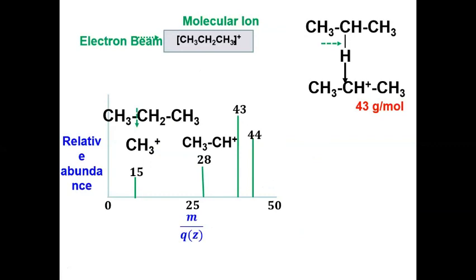Then we will get the peak at 43 gram per mole, a fragmented peak in the mass spectrometry.